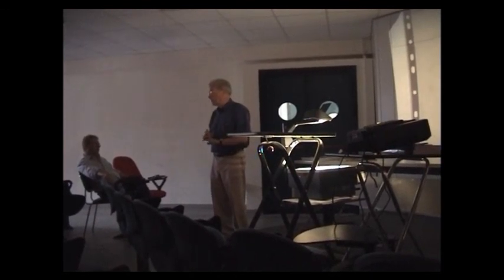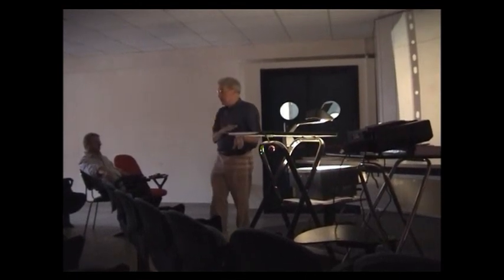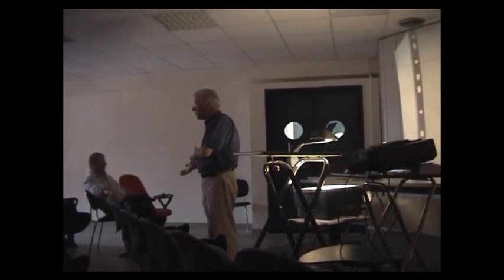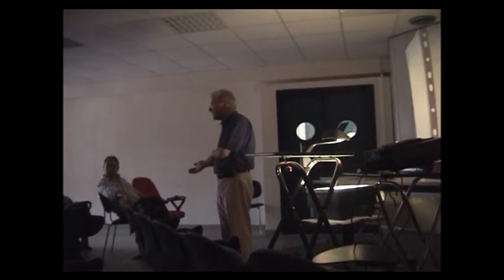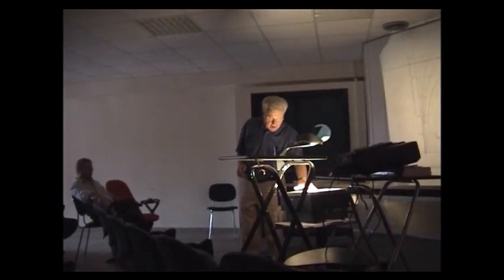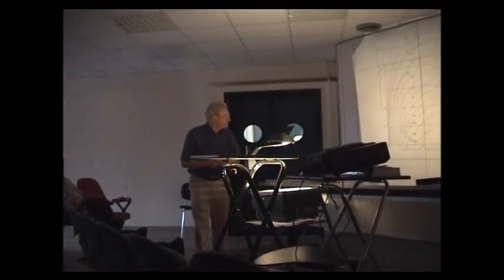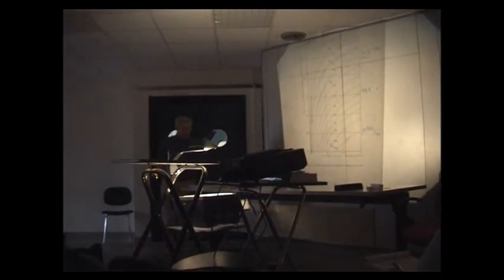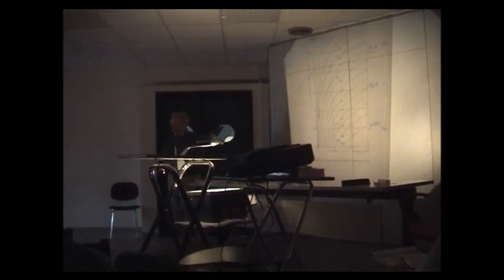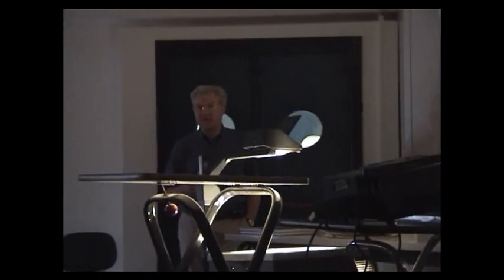Particle-induced X-ray emission is very similar to X-ray fluorescence, but we replace the incident X-rays in X-ray fluorescence by a beam of protons in order to make particle-induced X-ray emission. And as I was mainly involved in the study of gold, I give you here the situation of the intensity of the signal we are collecting when we are irradiating material containing gold, silver, and copper.